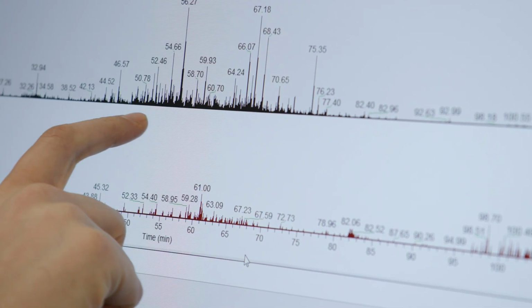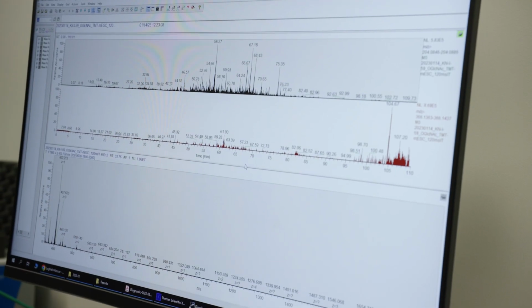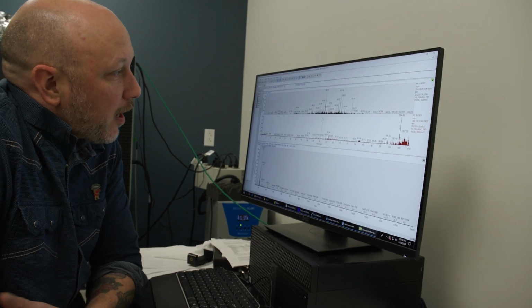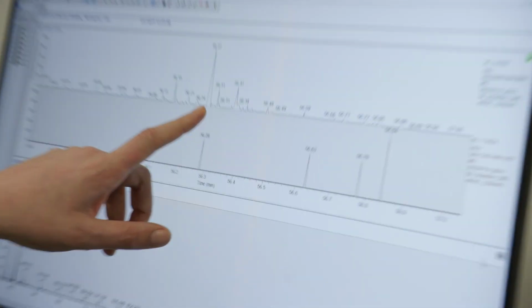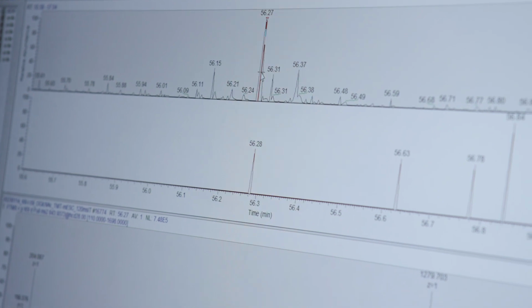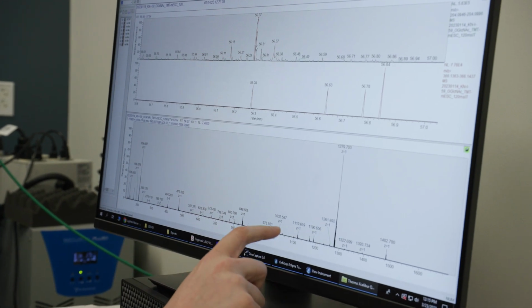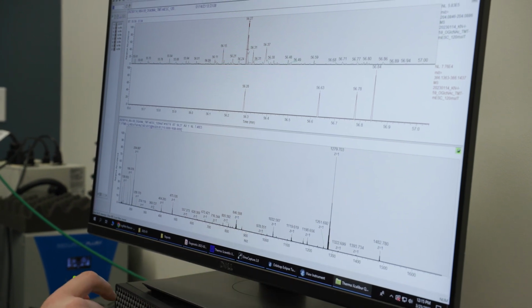And so this is allowing us to identify these glycopeptides for the first time in a throughput that hasn't been available before. I feel so warm inside when I look at these because I know I want to go in and look at these by hand. Back in the day, what you'd have to do is find your diagnostic ion, right? So here's a peak for our HexNAc, our GlcNAc, and then I would go in and make sure it has the diagnostic ions to tell me it's a glycopeptide. And then I would look at this by hand and say, I can tell the mass difference between here and here, right? And I can sequence this peptide by myself.